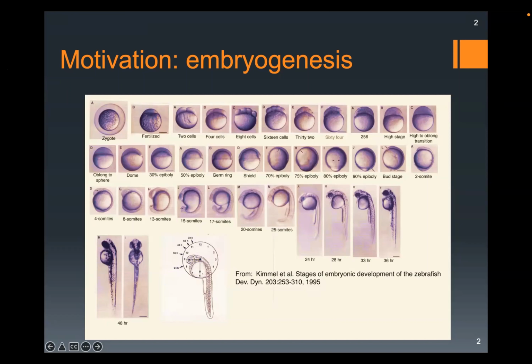And from then it's more the segmentation stage. The organogenesis, what I mean by organogenesis, is after 12 hours and 14 hours. Between 6 hours and 12 hours, you have the gastrulation, which is what you can see in this part here, characterized by the epiboly here. You see that? Okay.